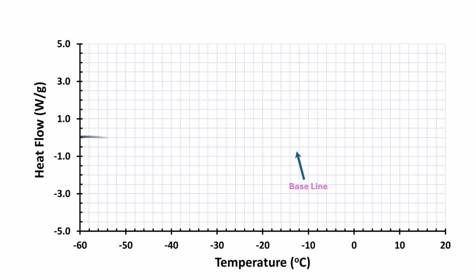First, look at the DSC endotherm as shown. If we draw a baseline toward the left by following the same slope, then it could intersect the onset of the endothermic peak.